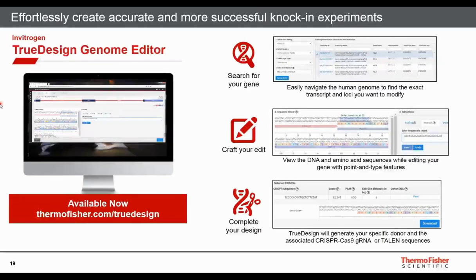And then lastly, the tool will go ahead and complete the design. It'll take in the design criteria that you've given it, the insertions, deletions, tags you want to add, and then it'll go ahead and design the appropriate CRISPR-Cas9 guide RNAs or the TAL effector nucleases that are going to be needed to generate the cut at that site, as well as design the donor molecule that'll be needed to accomplish that knock-in in the lab.